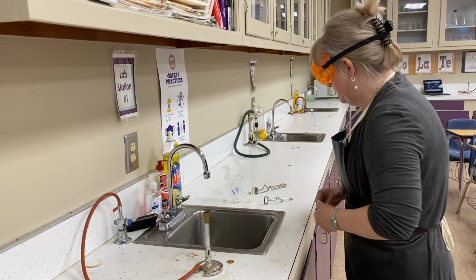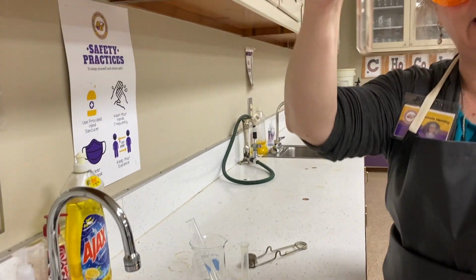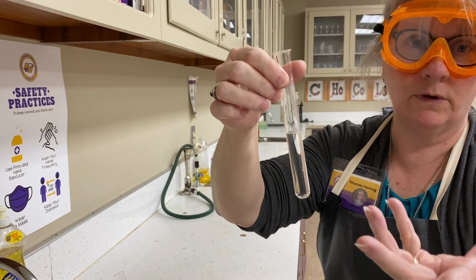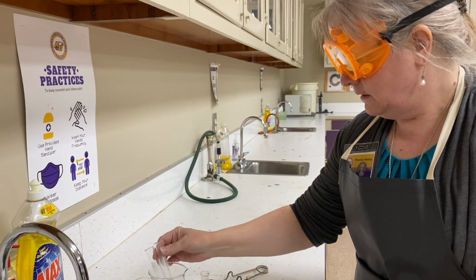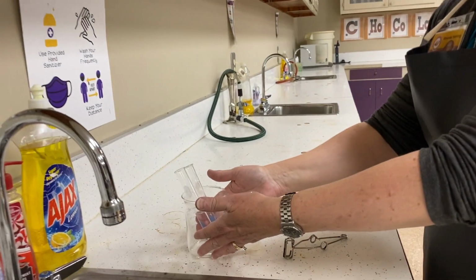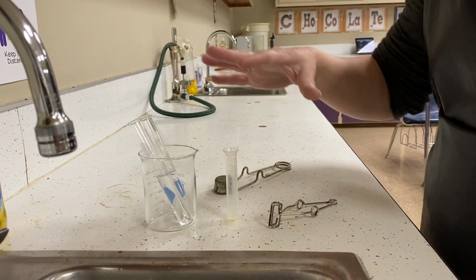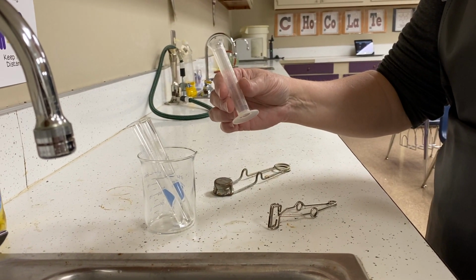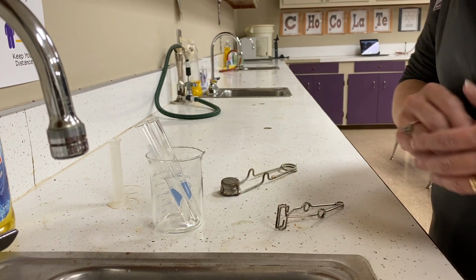So my materials will be a small test tube of water, half filled. This is about 10 milliliters if you really want to measure it, and that's okay, or you can just estimate it. Notice I have set them into a beaker for safety purposes, so I don't have them rolling around on the desk. And this was the 10 milliliter graduated cylinder that I used to fill. Okay, so these items here are now ready.